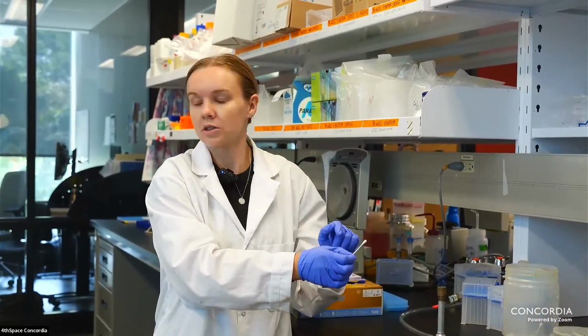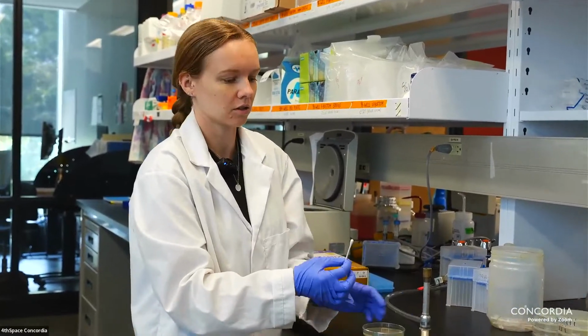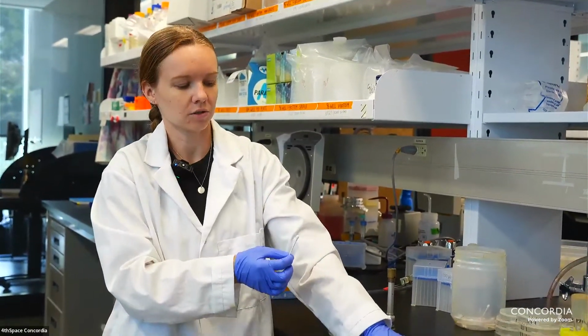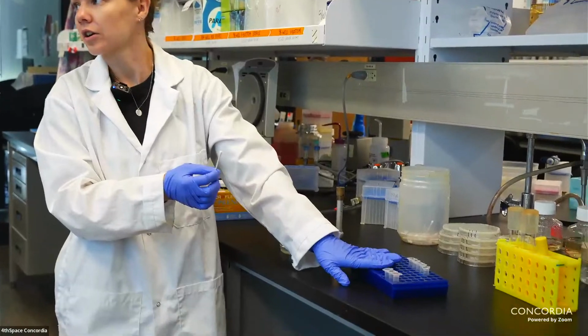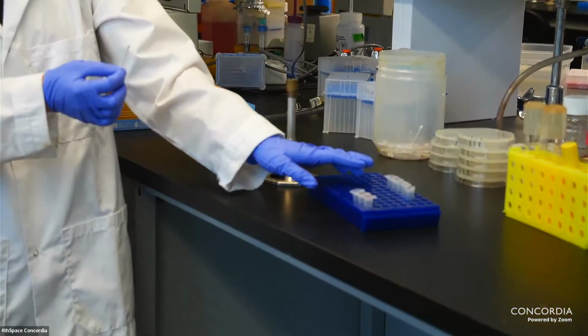And remember, you don't want to touch anything that's going to be touching the plate. So just don't touch the end that's going to touch the plate. And here's your cultures here. They're labeled with the color and whether they're E. coli, so for the bacterial plates, or yeast for the yeast plates.